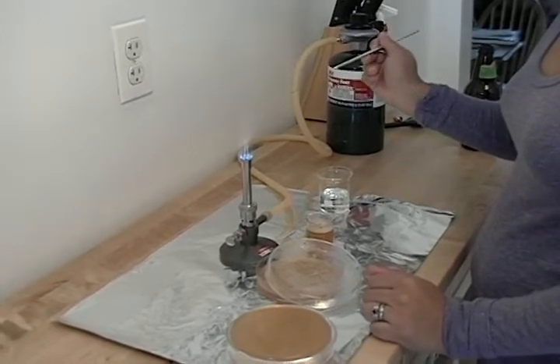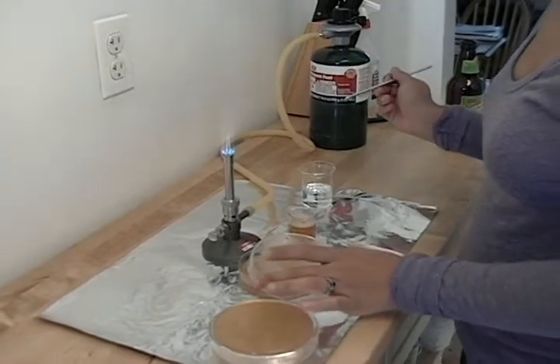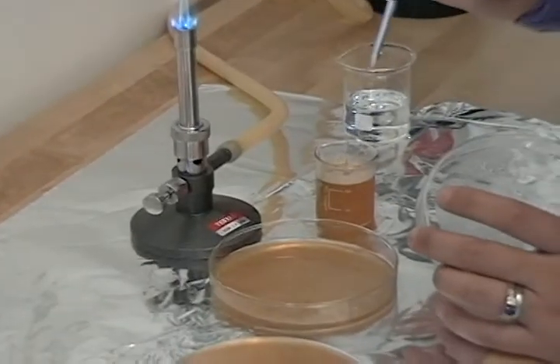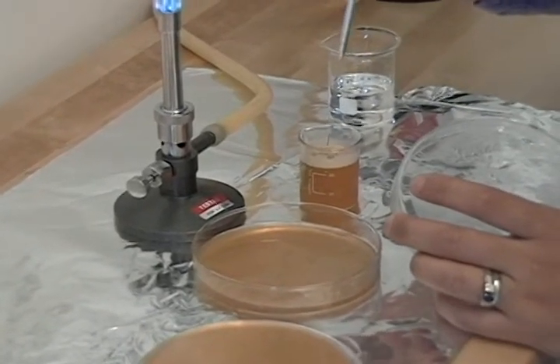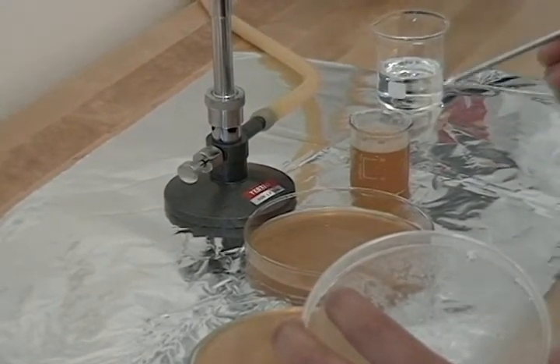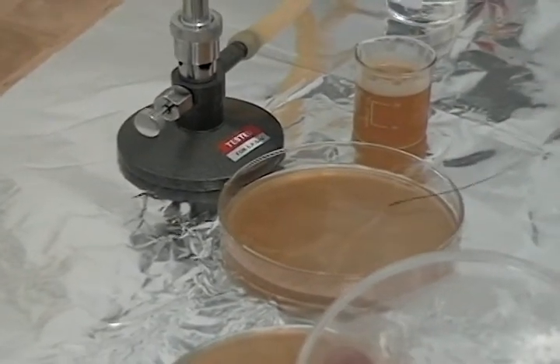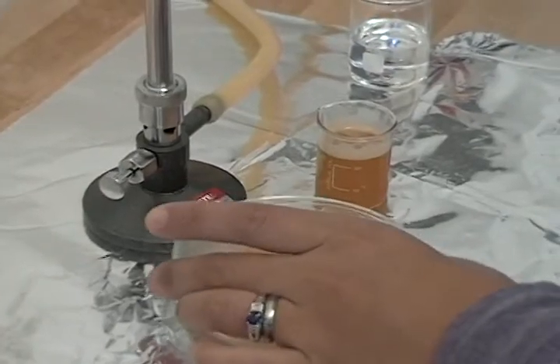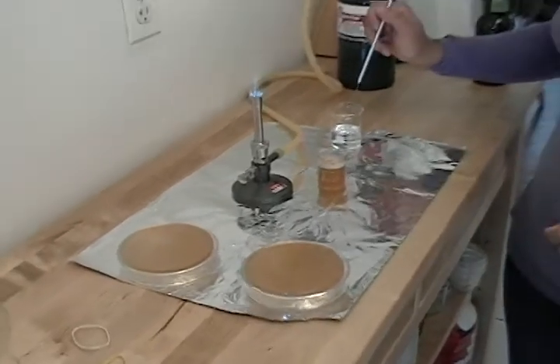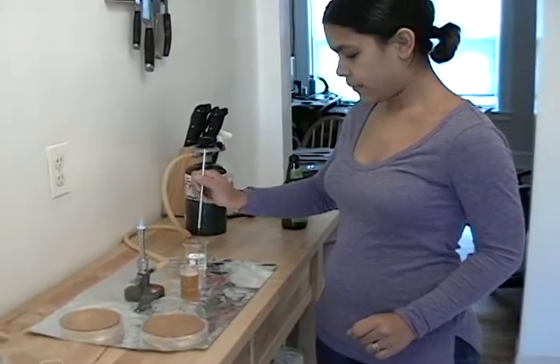She's just letting it air cool so she doesn't kill the yeast. And now we incubate for a few days until we start to see yeast. And that's it. Thank you, yeast geneticist Lade.